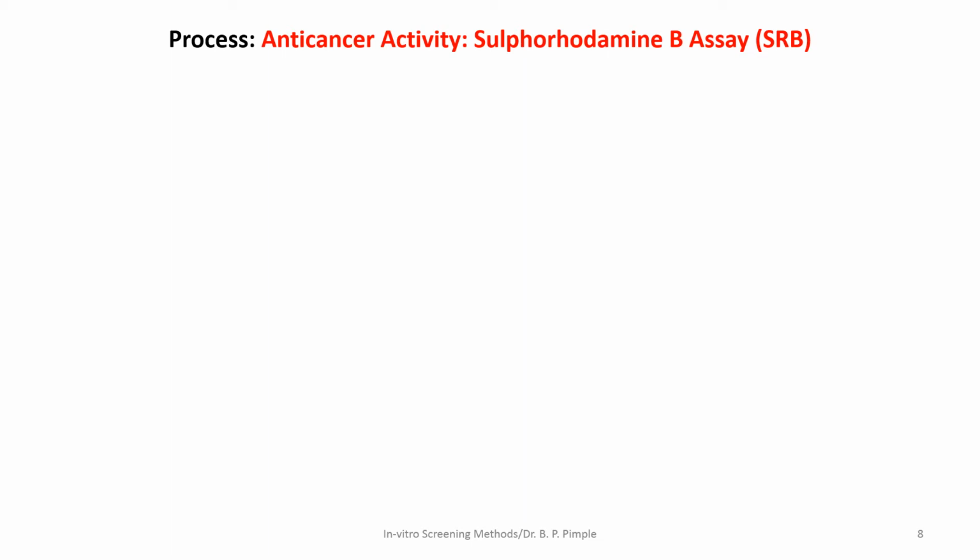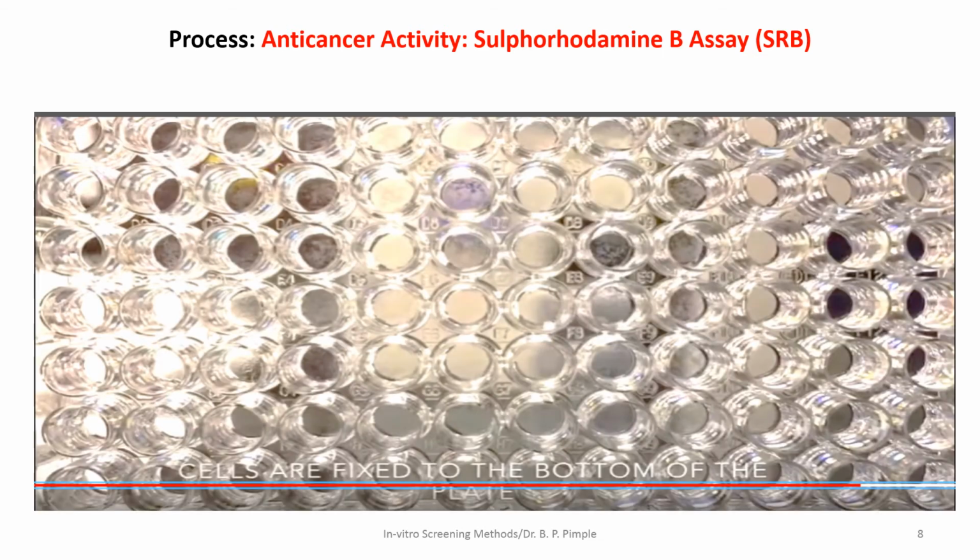Now we will discuss the major steps in the procedure. As such, the procedure is very lengthy. It takes more than 24 hours, or sometimes 2 days, to complete this assay protocol. So we will discuss only the important steps in the procedure.